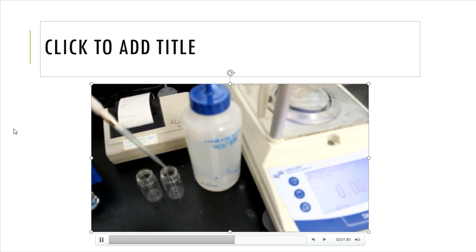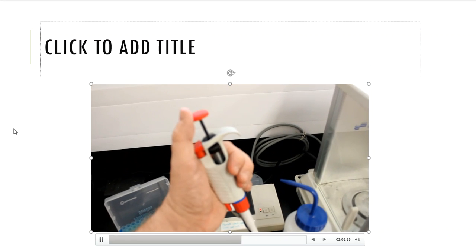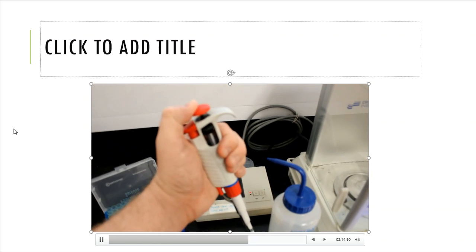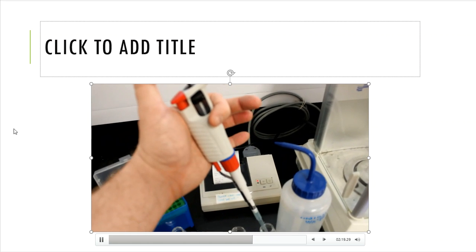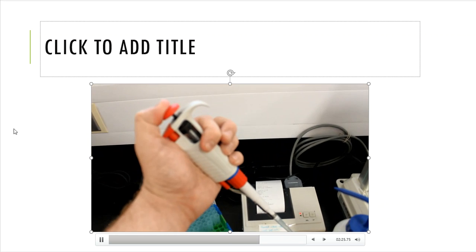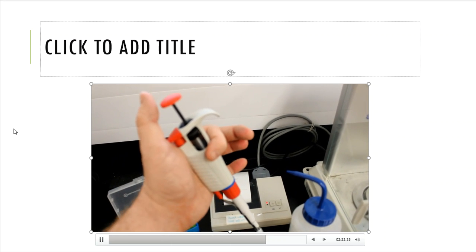I'm then going to put it into my sample, whether it's water or my unknown, and I'm going to slowly, up here at the very top, push the plunger down first, put it into my sample, and then slowly let the plunger off. In doing that, I'm ensuring that no air bubbles are getting inside the system. So you have to create the air pocket first, then put it into your sample, and then slowly let up on the plunger.